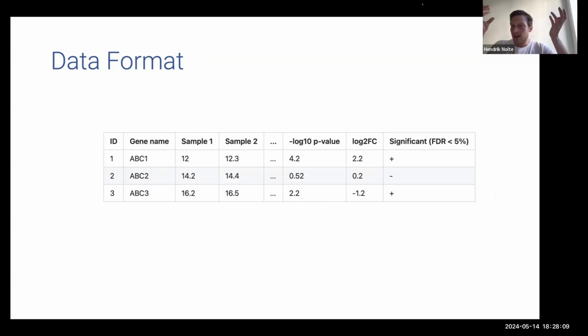And the most interesting part, meaning the proteins or the features that are having a very low p-value, will be squeezed in a very small part of the graph. But if you're using the minus log 10 transformation, then these very low values become very high and are just visually more appealing. You will actually see what I mean by this in a second. And then what we usually have, at least in our workflow, is a column which indicates by a plus sign if this is significant.